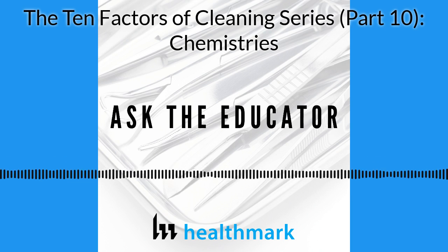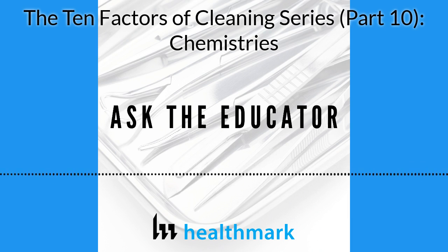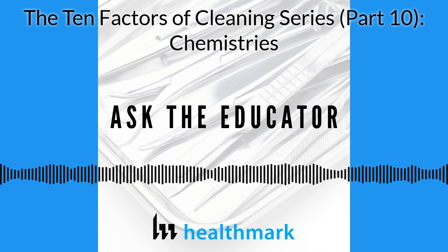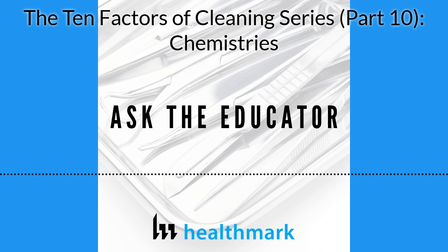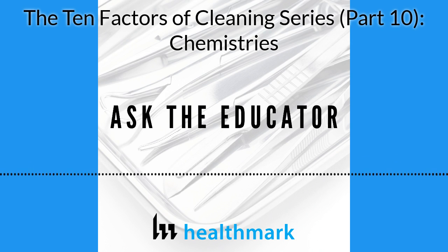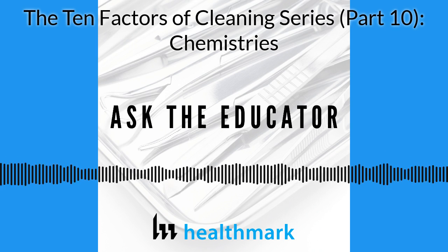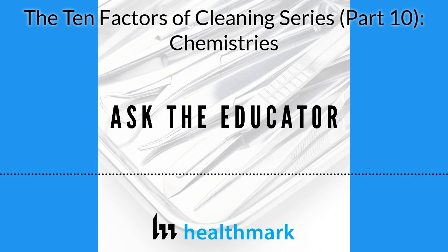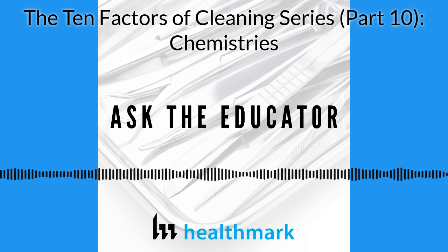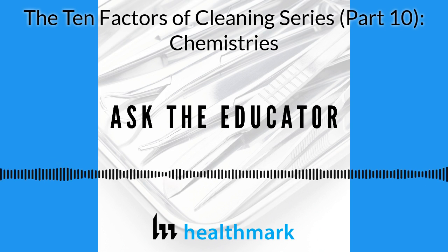They all got pluses and minuses. But there are different terms that people do need to understand when it comes to it. They have chelating agents and emulsifiers. And what do they do? How much do they put into it? That's what makes these cleaning chemistries so different, these formulations. And that to me is what people need to understand and really work with their cleaning solution companies.